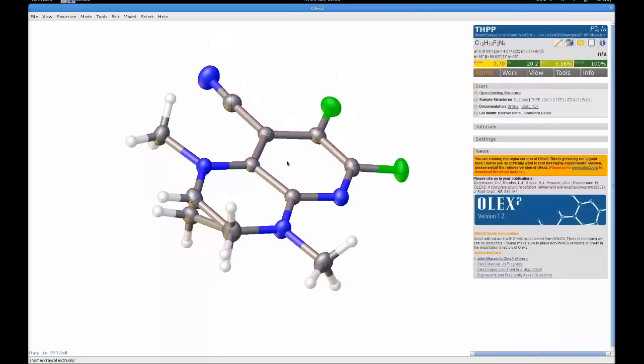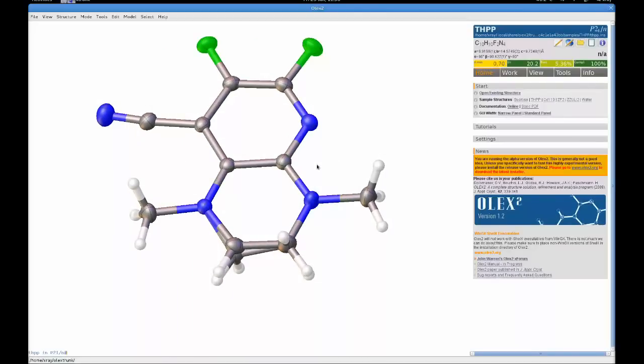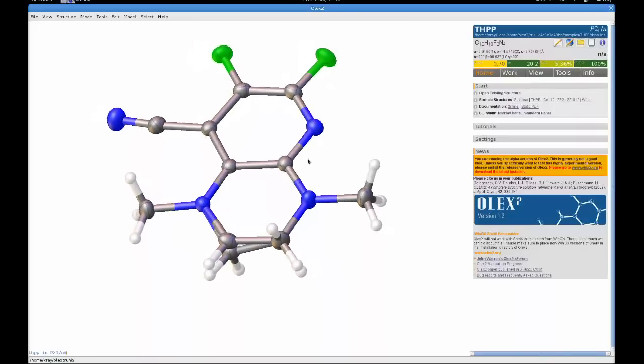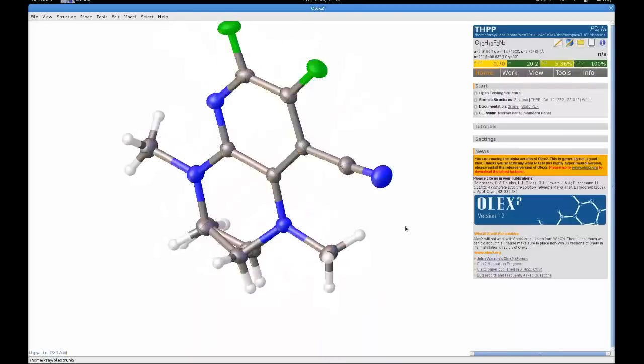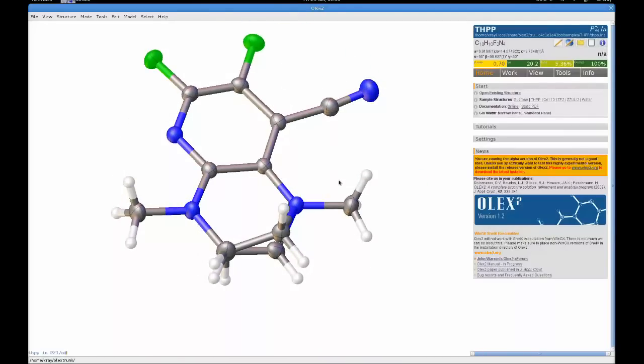Now this is at the moment a very waffly demo, and that's fine because it's not really for much human consumption. It's just really just for me playing about and seeing how things work and how they upload up to YouTube, and whether the guys back in the Olex2 lab are happy with everything. So let's start off with some simple fun features.